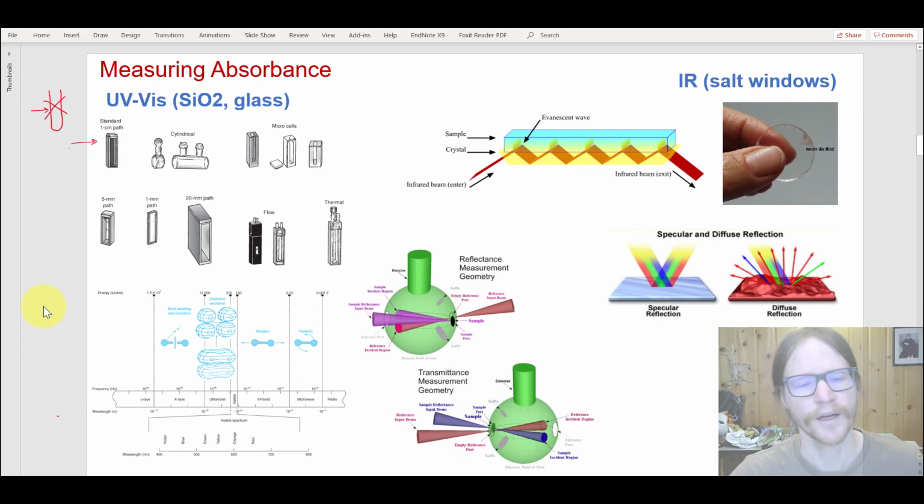Those are much, much worse in terms of error because as you have incident photons on a rounded object, a much higher proportion of those photons are going to be refracted, because the apparent thickness of a curved surface changes depending on where the photon strikes it. So the best types of cuvettes, in terms of minimizing error, are those that have really flat sides.